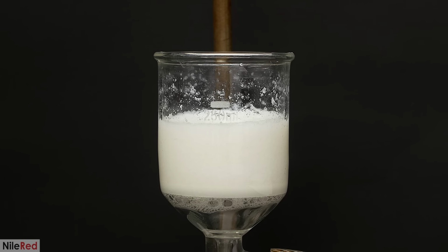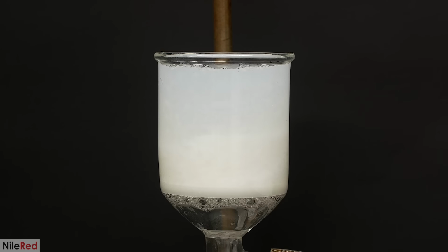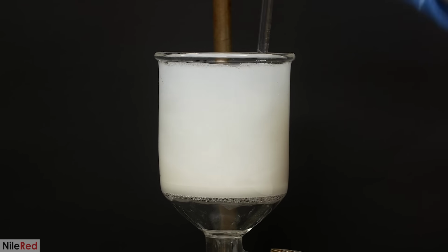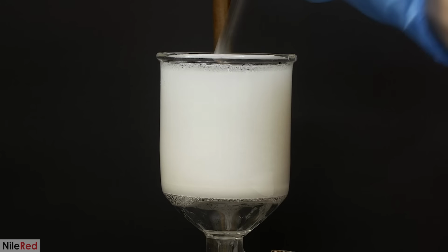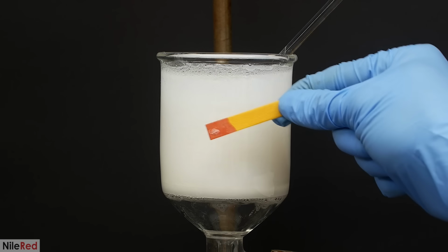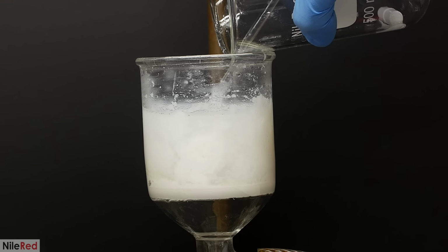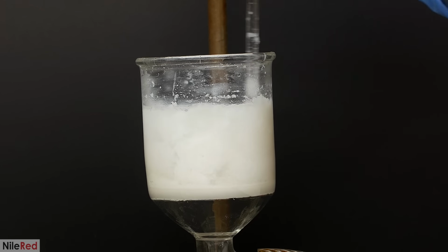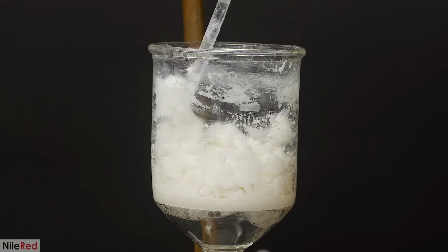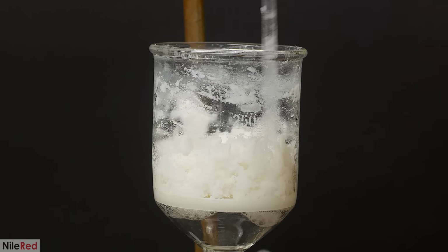The reaction mixture that I'm filtering off is highly acidic, and well, this gets all absorbed into the cellulose. So just pulling away the water isn't good enough, and there's a whole bunch of acid that's still trapped inside. And unfortunately, it doesn't go away with just one washing, and it takes several. There's also no way to know exactly how many it'll take. I basically just need to keep doing them and testing the pH of the water that passes through. I know I'm done when the pH paper tells me it's neutral or only slightly acidic.